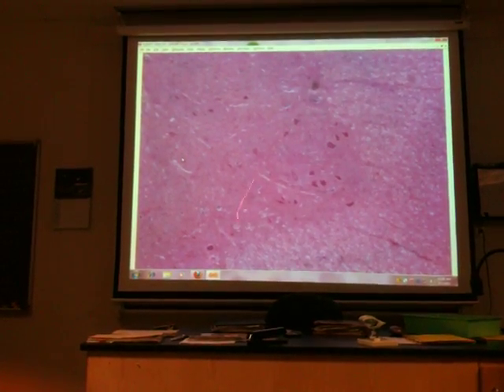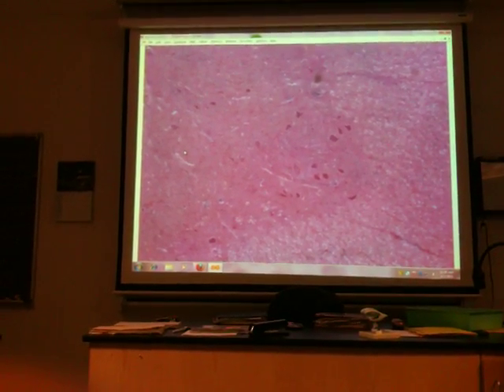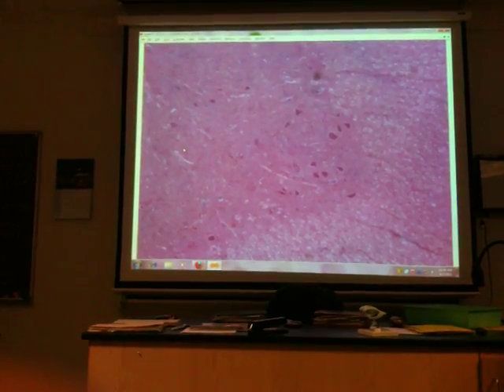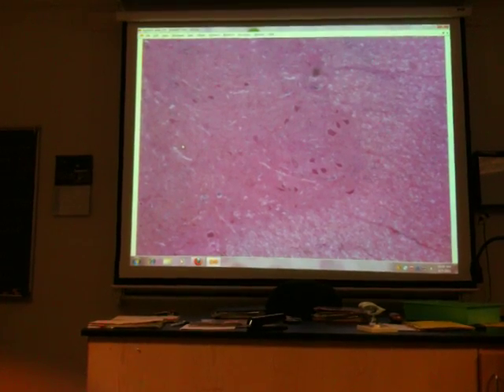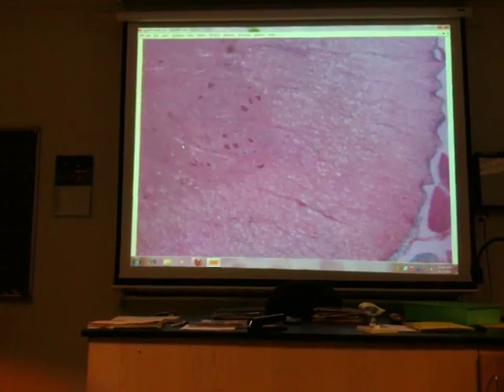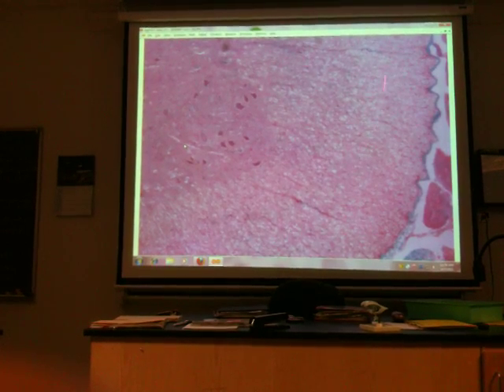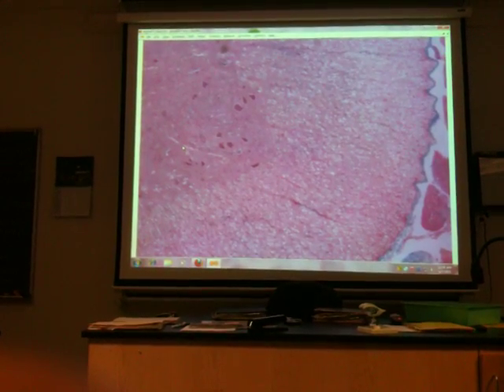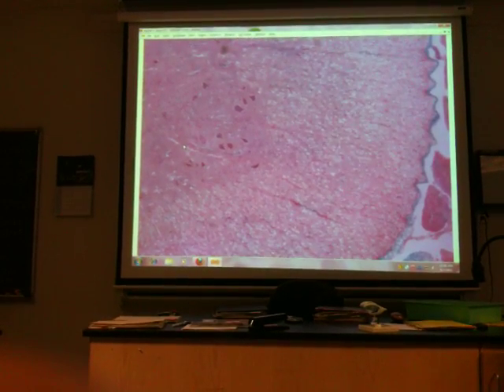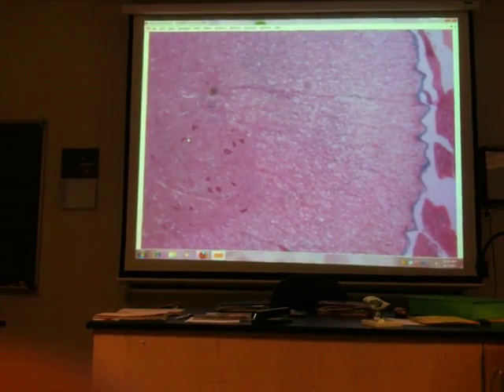We're going to be talking more about this. We're going to be associating this with only one branch of the autonomic nervous system. So on Tuesday, if you don't read ahead, we'll find out if it's sympathetic nervous system or parasympathetic. Okay? So that's the lateral gray column. We go out to the edge of the cord, and what's the white matter called over here? Lateral white column.